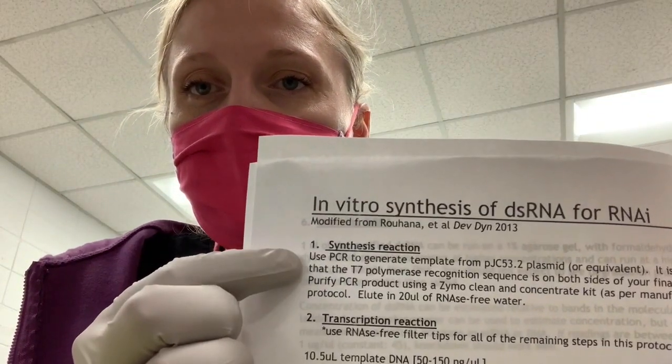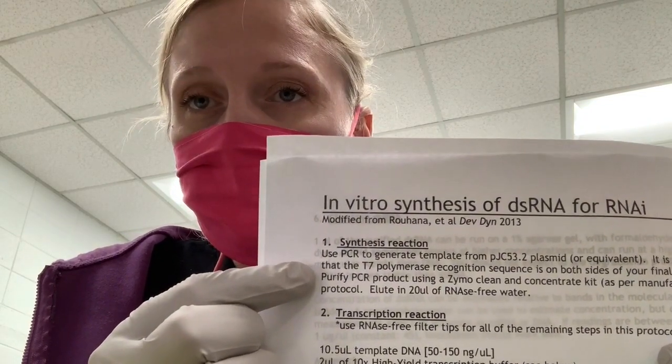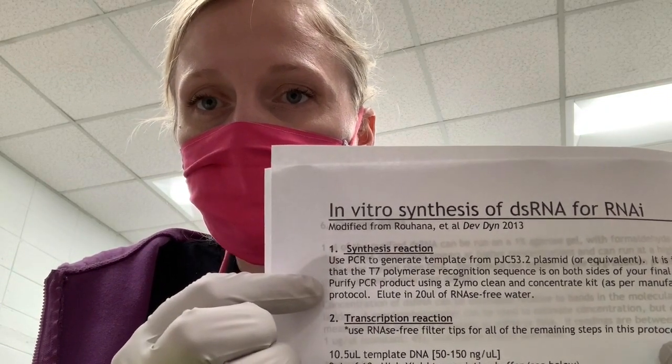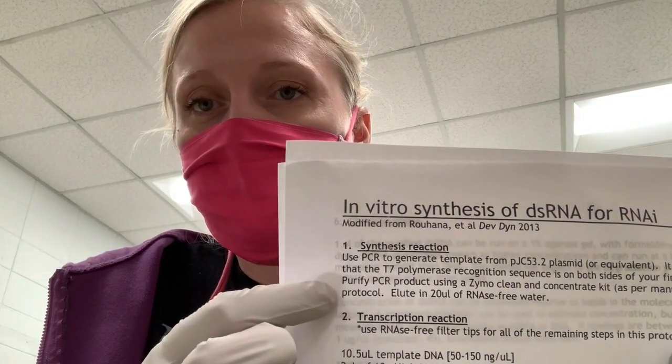You can see the other videos for hot start PCR and DNA purification with the clean and concentrator kit for the first few parts of this protocol. Those can be used for other things too, but that's how you would start out this protocol. You would do your PCR.